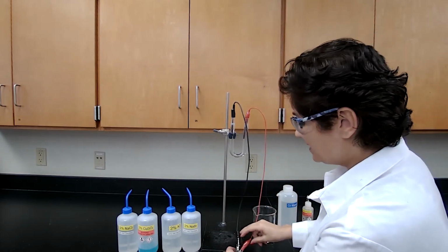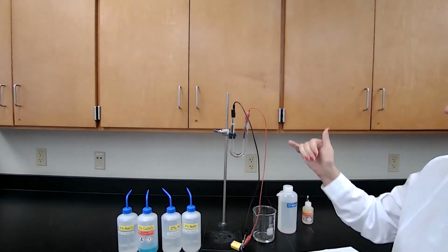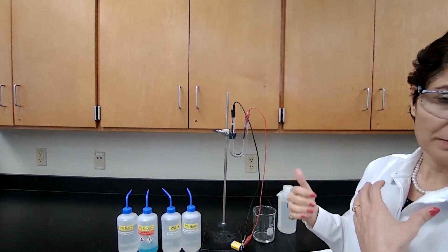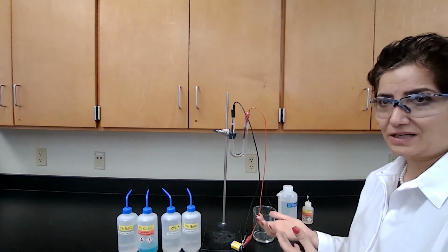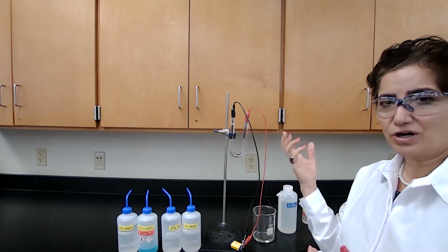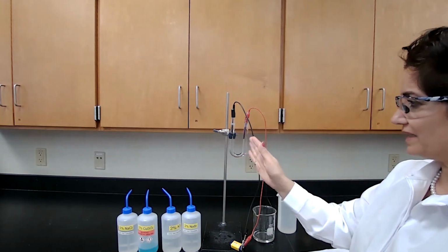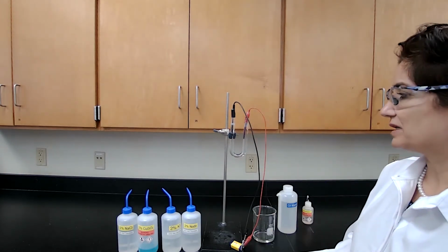If water is being reduced, we expect pink color to appear on the cathode side. And any side that pink color appears, we can call that the cathode side because we know reduction is taking place, because hydroxide ion has been produced. Based on the experiments that we had, we know the right side is the cathode side.